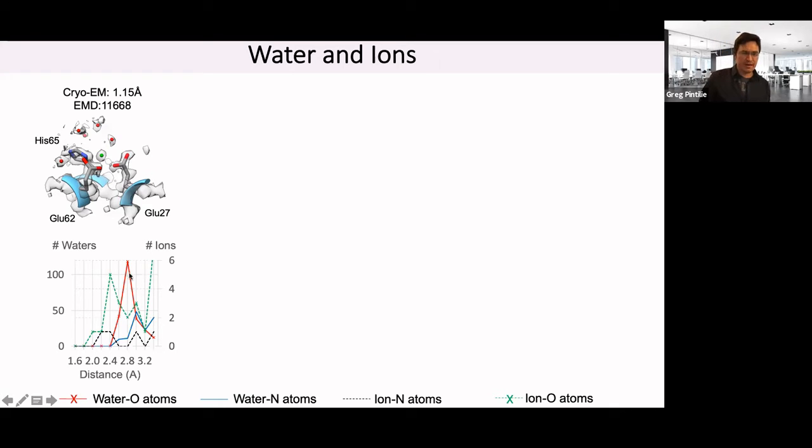Now, the interesting thing that also came out of this is that if we create these plots, which are radial distance plots of the number of atoms found at a certain distance away from certain types of atoms, the red curve shows this done for the entire apoferritin protein.